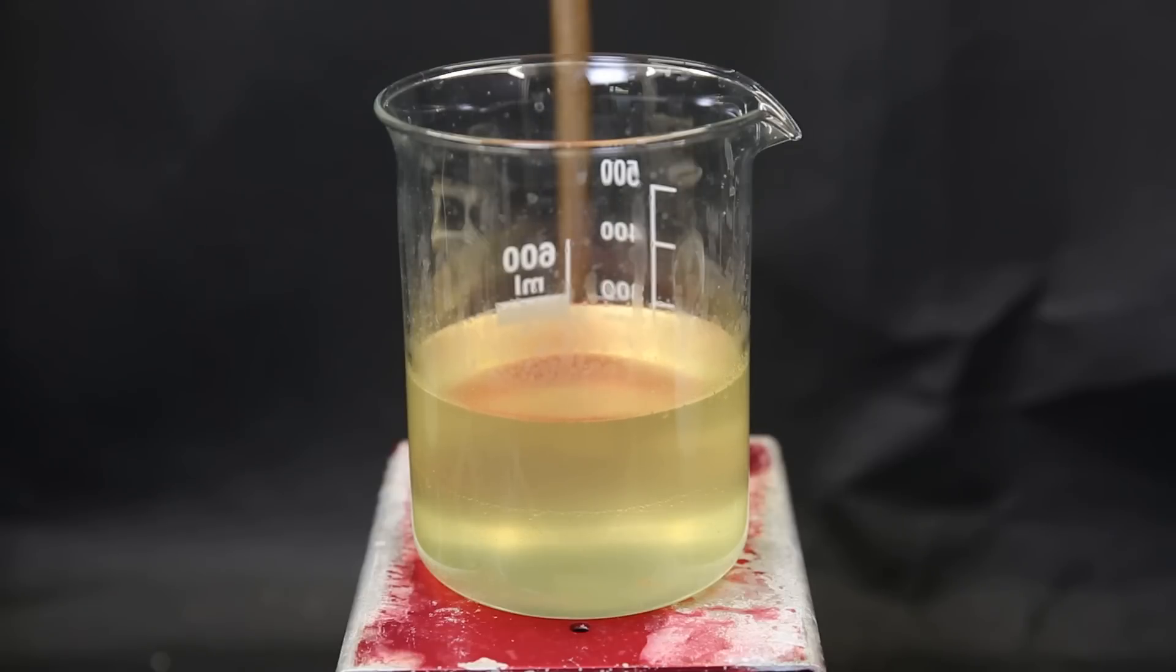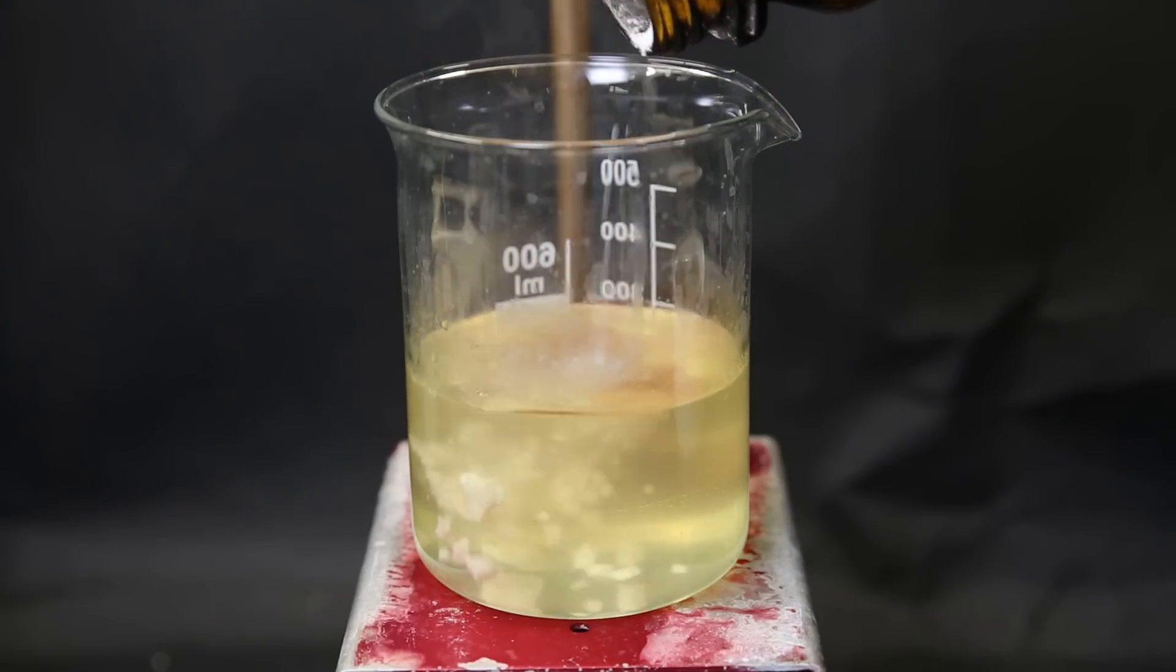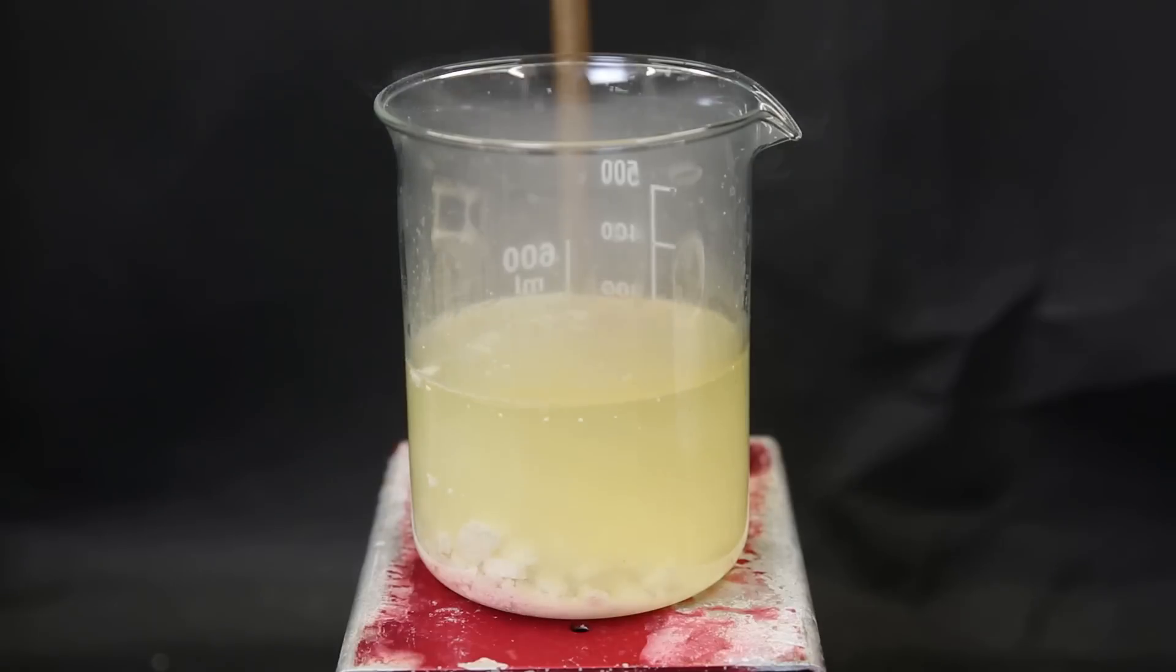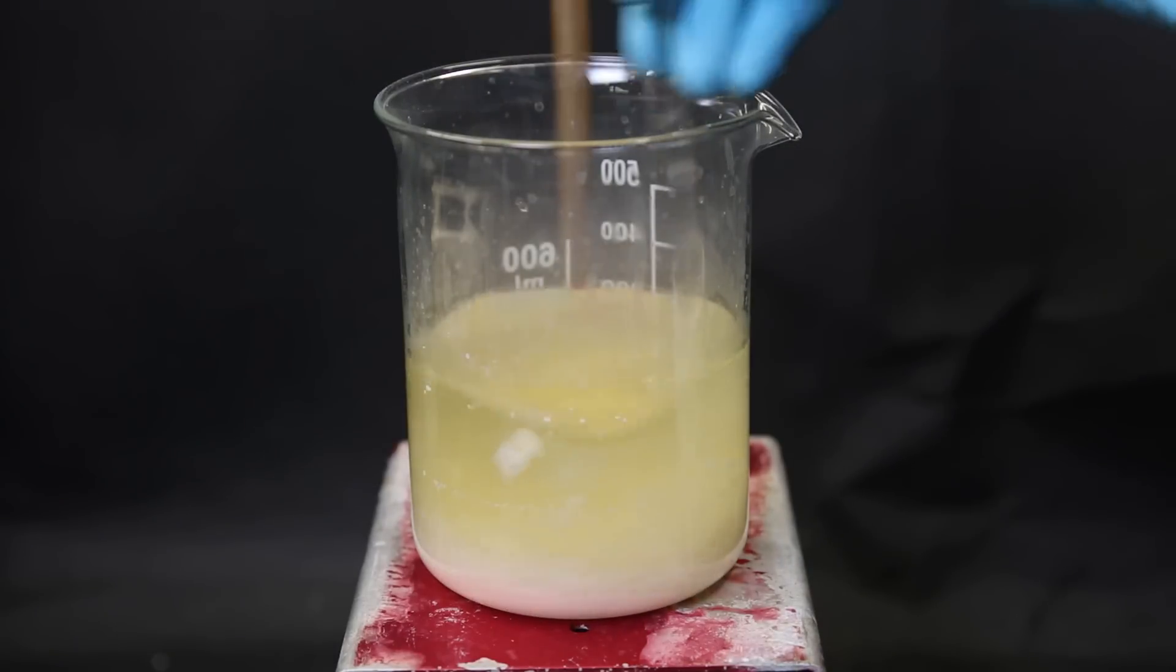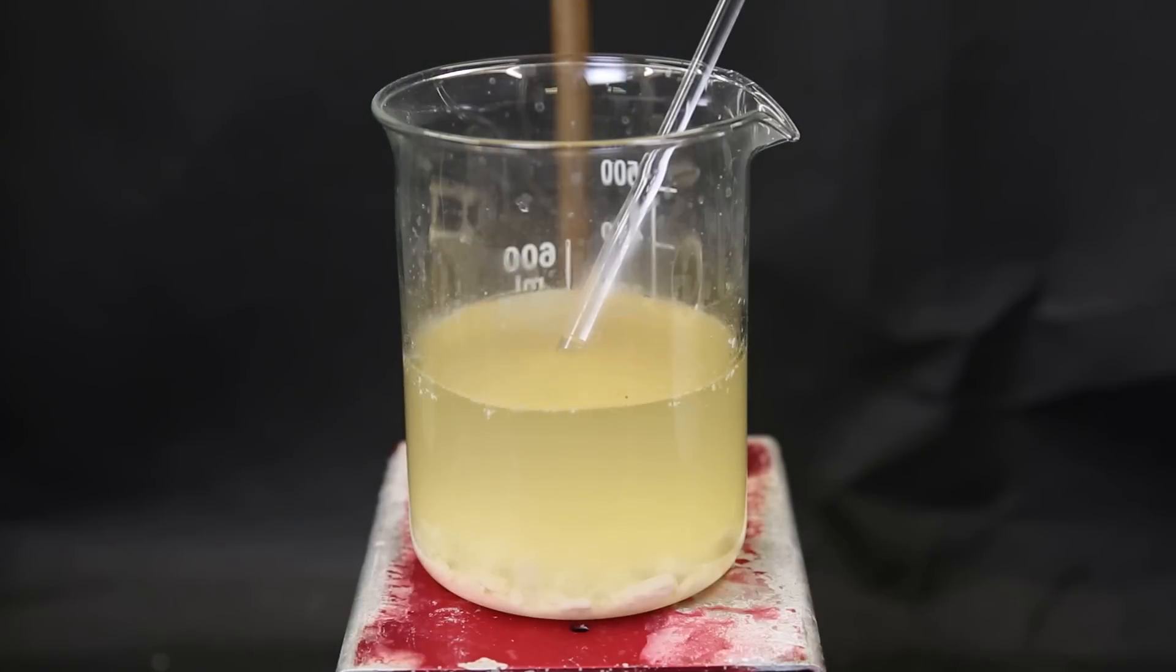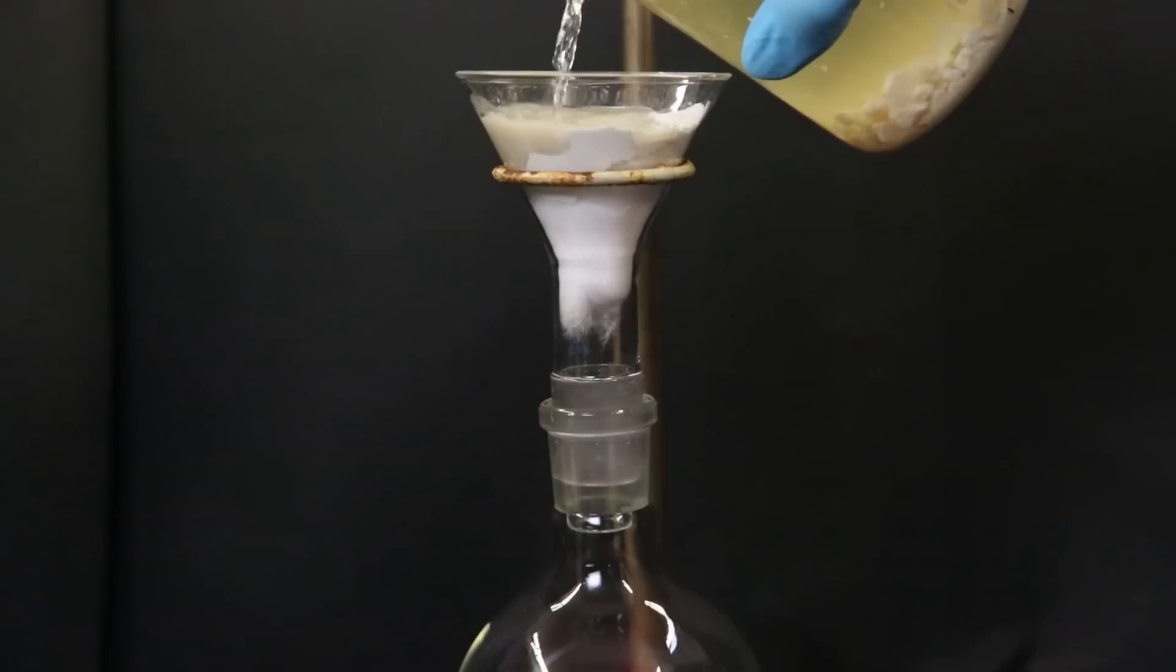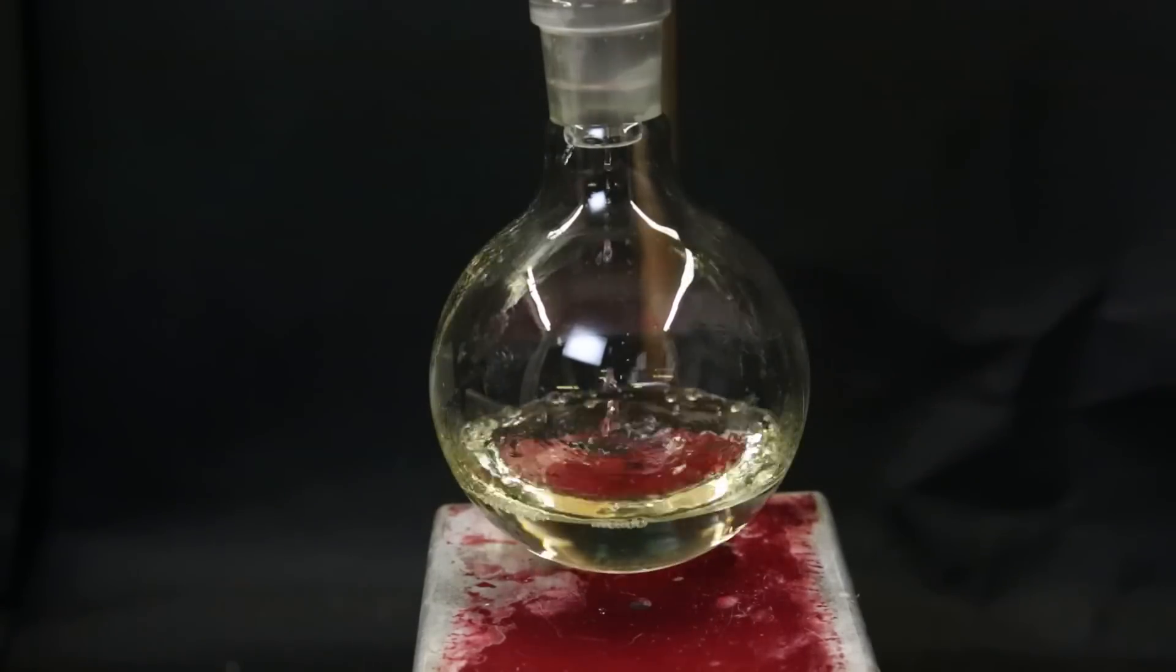Now to dry it, I will dump in a bunch of anhydrous magnesium sulfate. I stir the mixture and then let it sit for a while. After that, I filter the mixture through some cotton and celite, and I collect the now clear yellow solution.